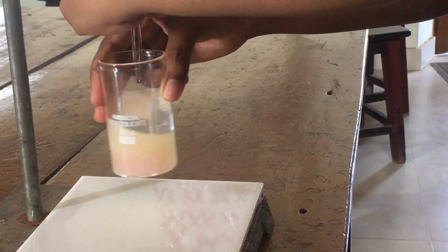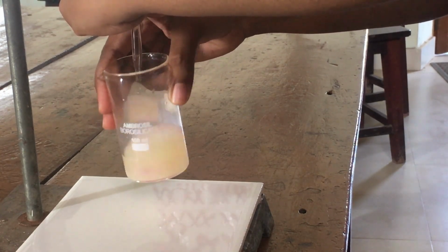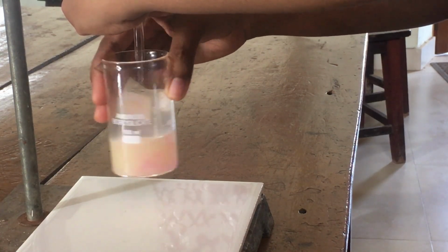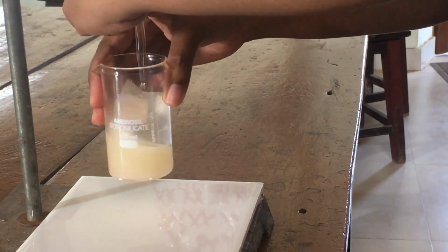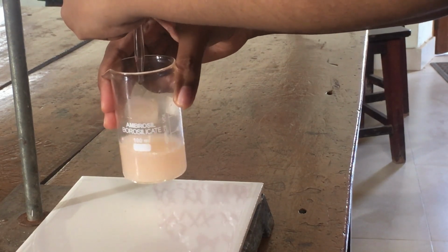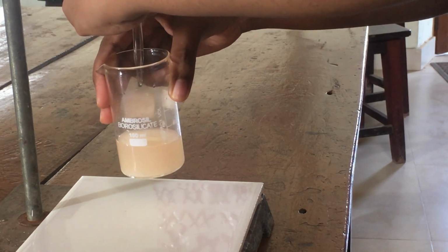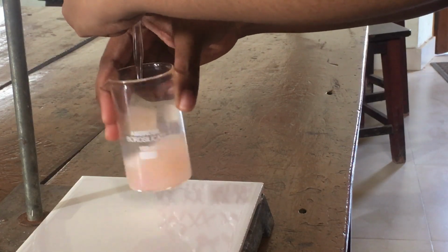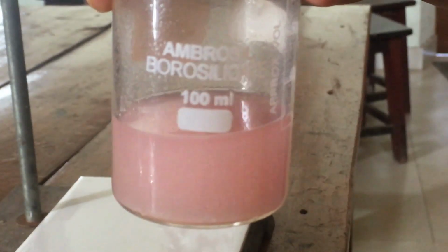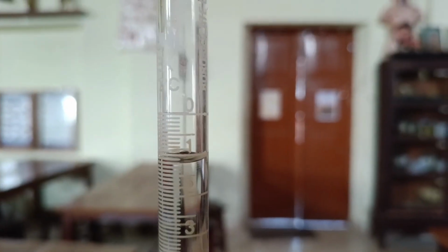We need to be very careful to add drop by drop only. I think we are almost approaching the endpoint. We need to slow down. Yes, almost attained. Yes, this is the end point. And for the titration of the rancid fat, we got the titration value as 1.2. Next is the calculation.